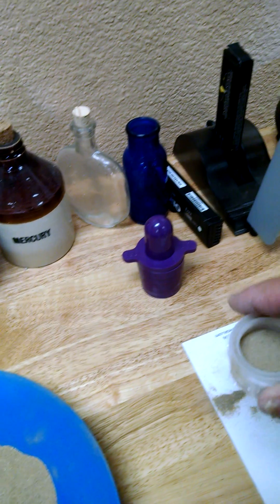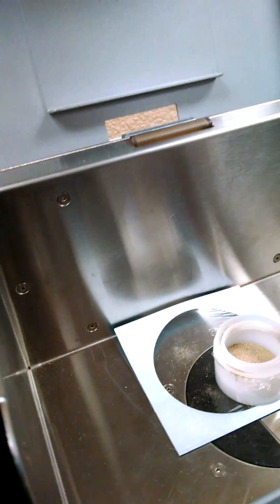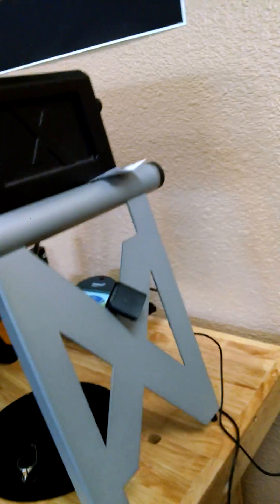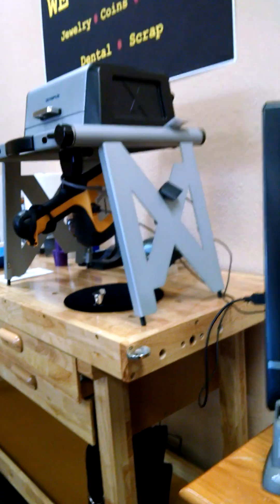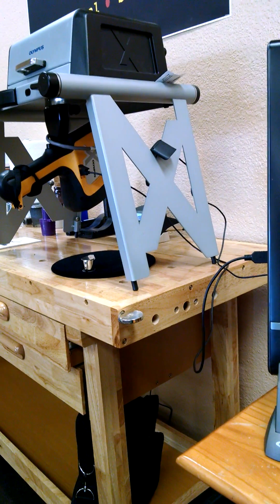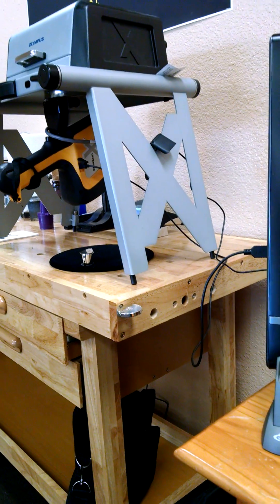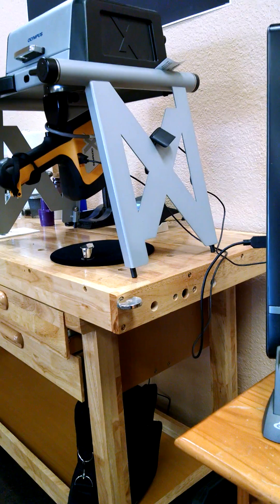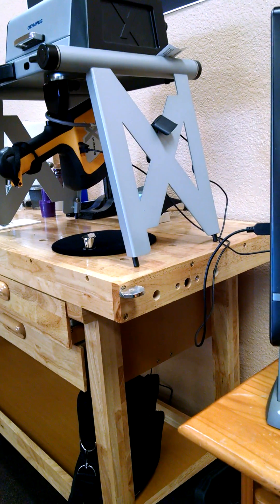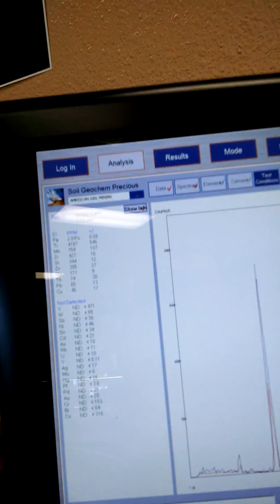We're going to take this and just tap down the sample a little bit. I'll put it right inside our machine here and shut the door — it's a safety door. This is X-ray, and it does have radiation; that's what it's doing. It's X-raying the sample, and the sample kind of fluoresces, like a blacklight. That's how you get the XRF — X-ray fluorescence. It fluoresces at a wavelength we can't see, but the machine reads how it fluoresces.